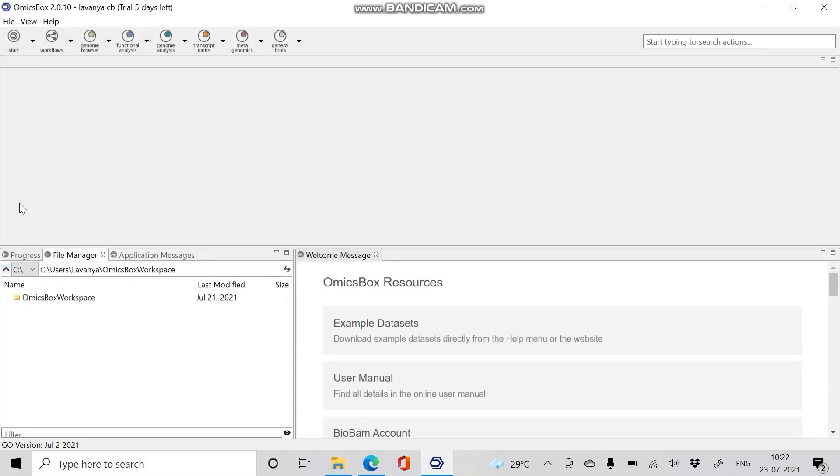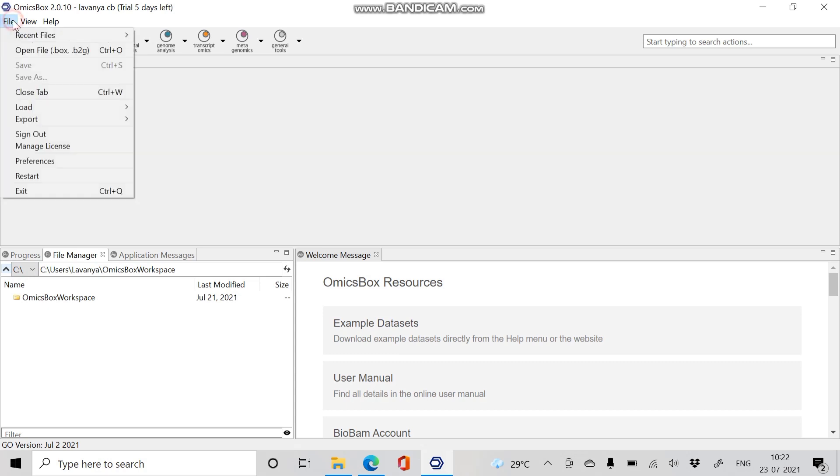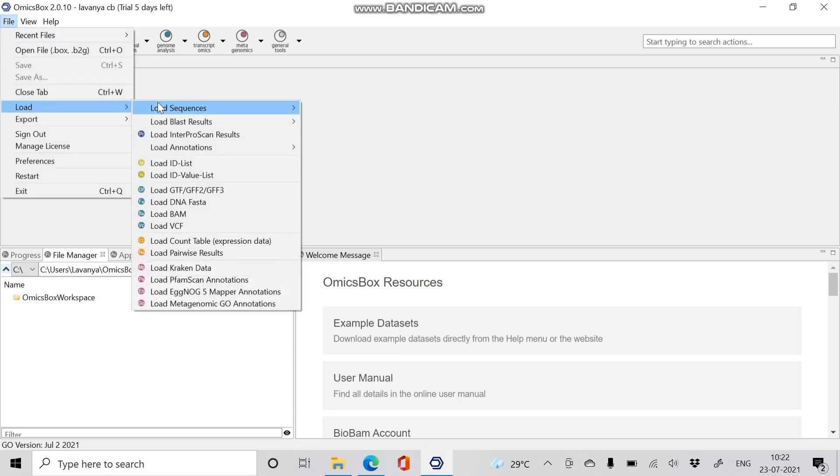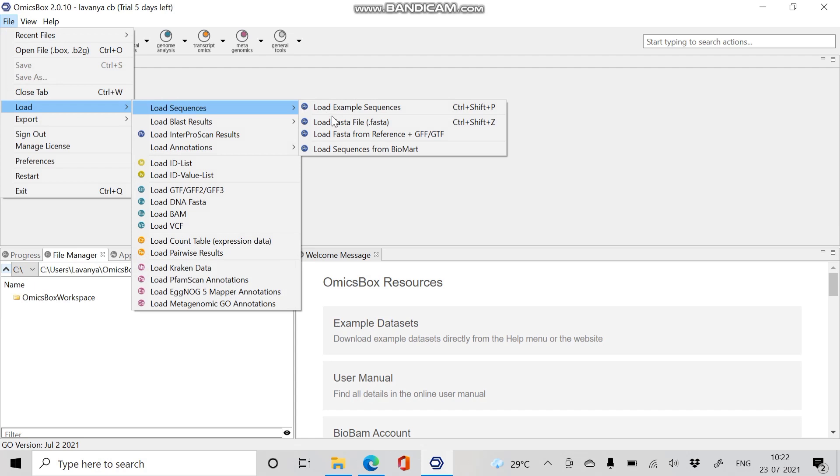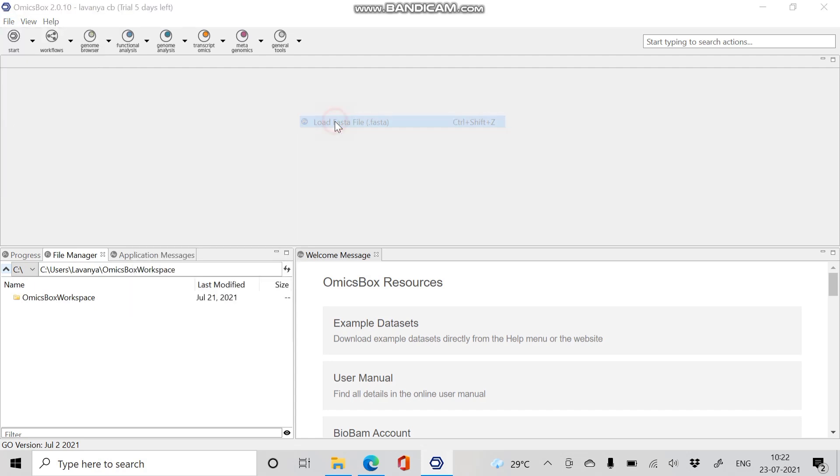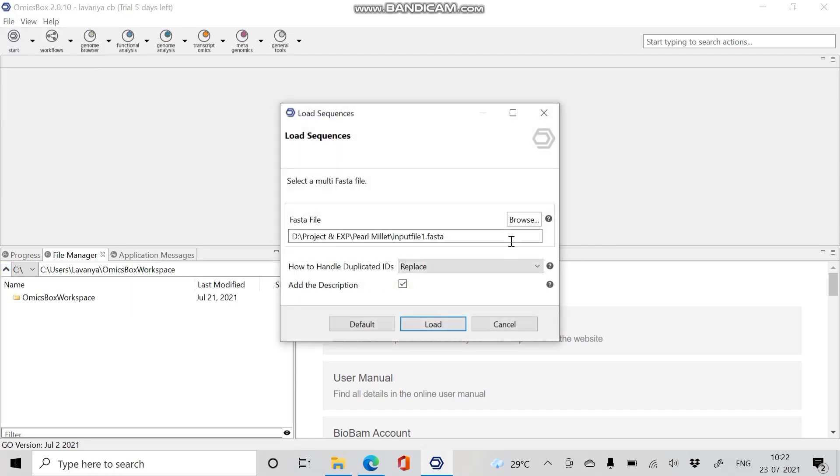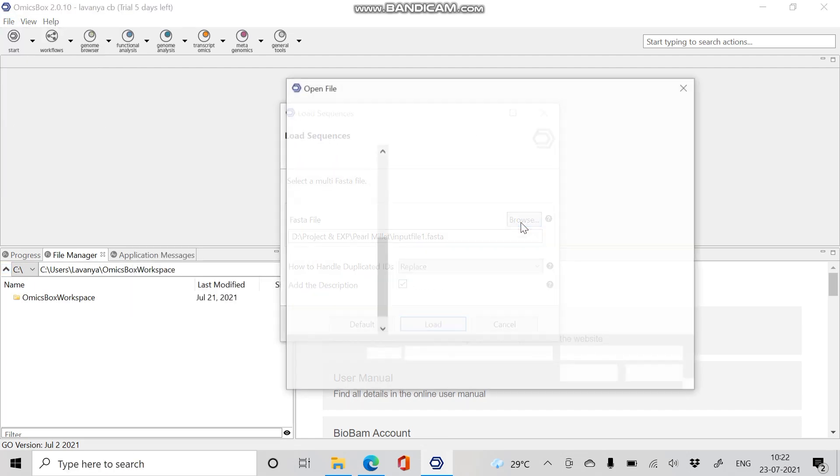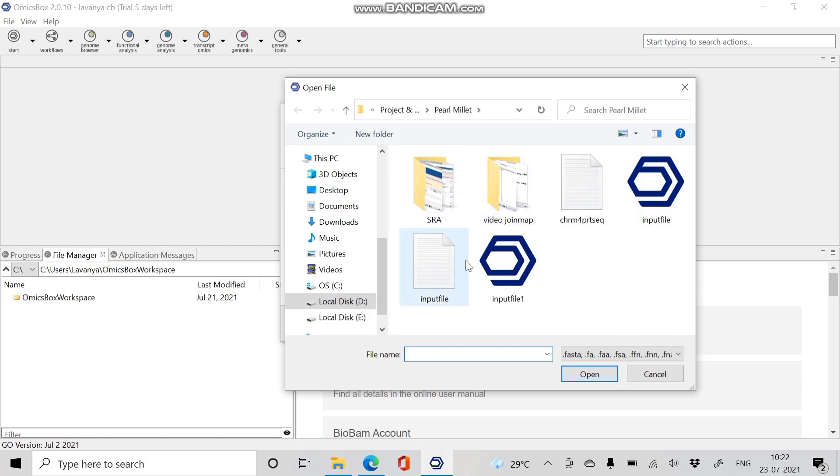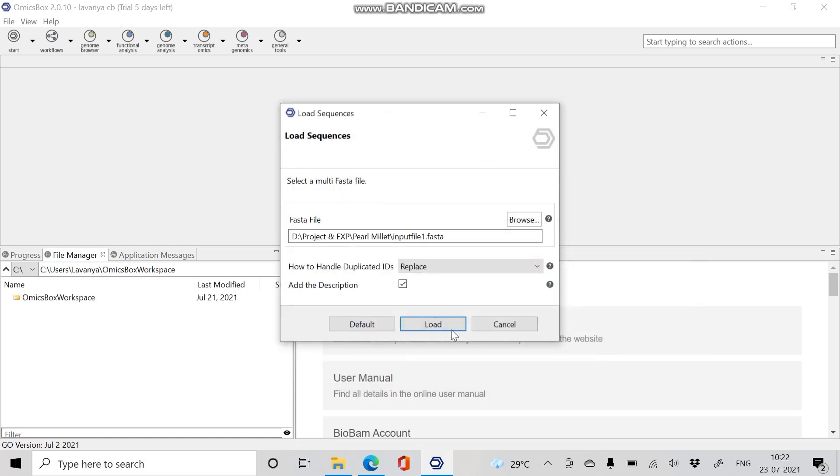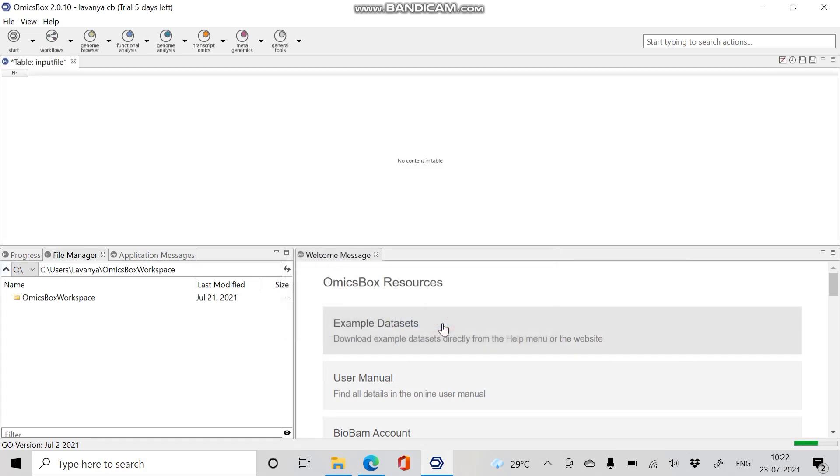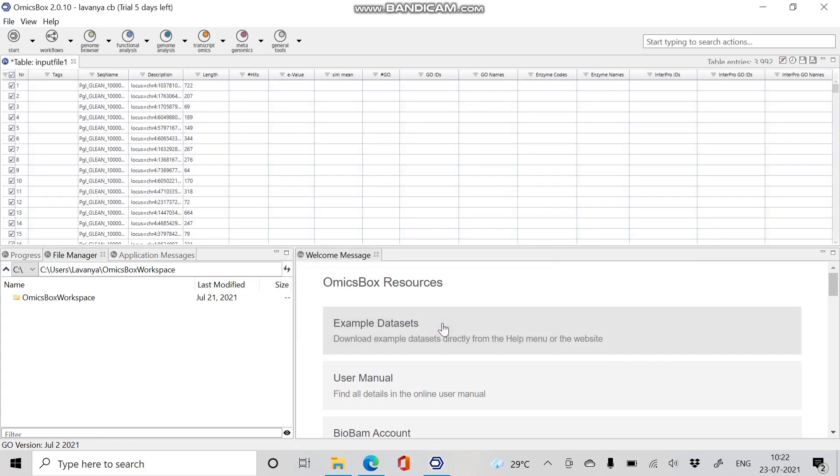Open OmicsBox. Step 1 is to load our data. We have saved our input file in FASTA format. Now go to File, Load, Load Sequence, and Load FASTA file. Select your file containing the set of sequences in FASTA format and give Load. Once it is loaded, our input sequences are arranged based on the sequence name in tab format.